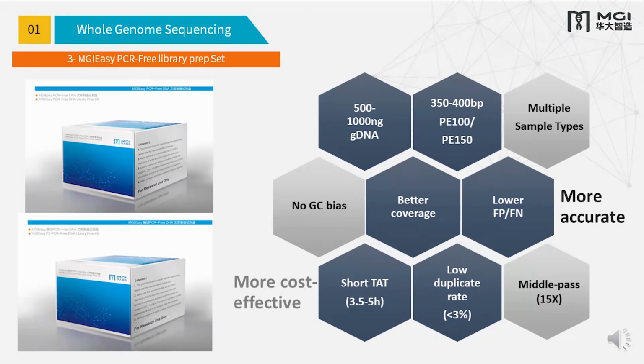Because there is no PCR, the whole workflow will save a lot of time. If you have a PCR, you have to prepare and mix the reagents, prepare the PCR, and prepare the post-PCR base purification, so this still saves your time.